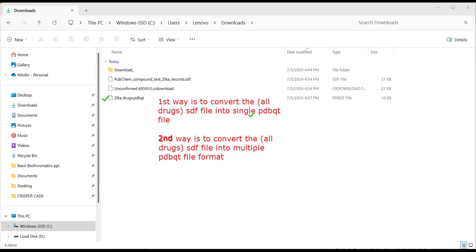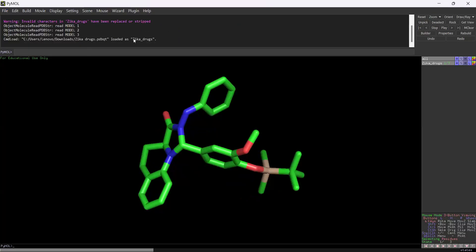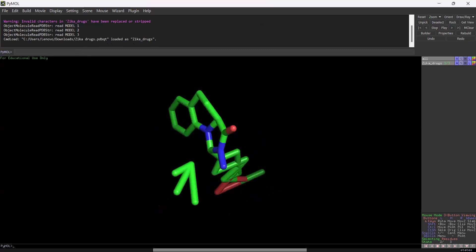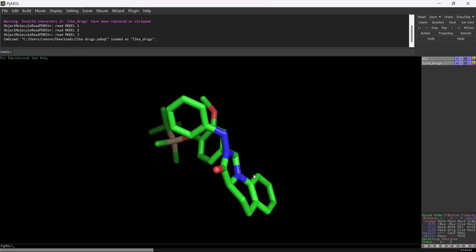Once PyMOL is launched on your system, you have to open the particular PDBQT drugs file. Now I'm going to show you how to do that: open your file and launch PyMOL. Once launched, you can see I have opened the PDBQT file of the drugs. There are three drugs loaded — these three drugs are visible on screen and loaded properly. This is the first approach where you convert your SDF file to a single PDBQT.